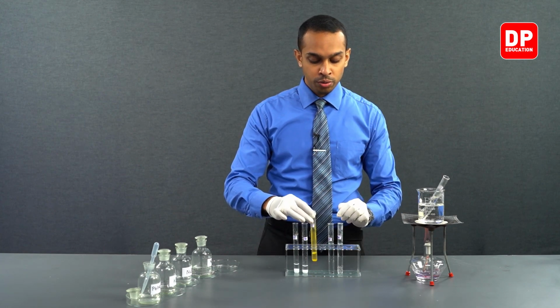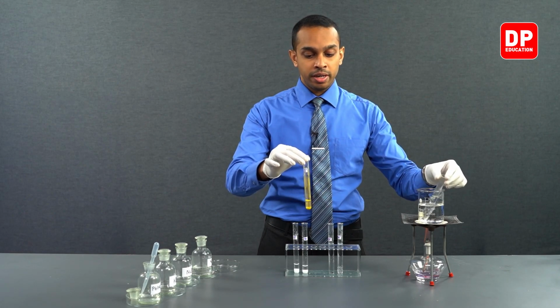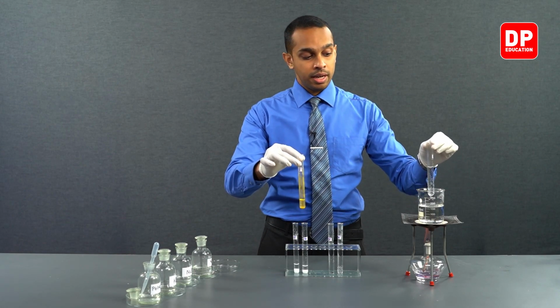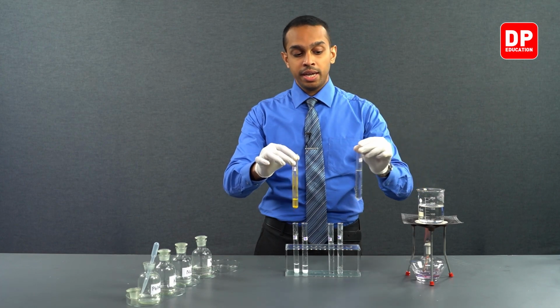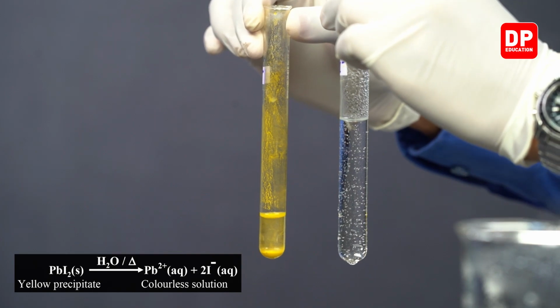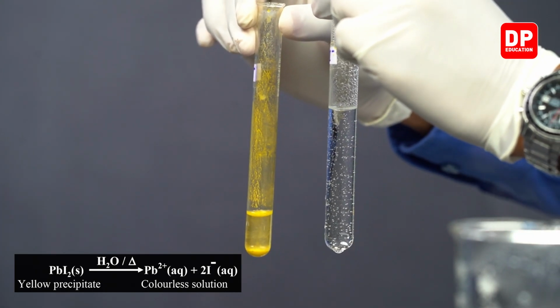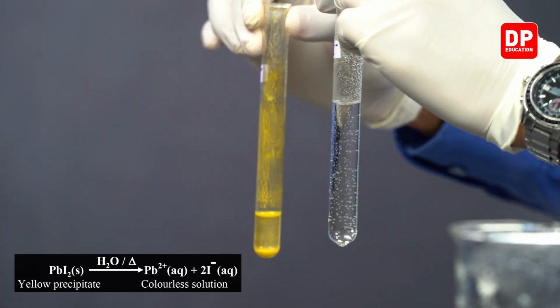And then we'll move on to lead iodide. Again, we took a little bit of lead iodide precipitate and heated it with a little bit of water, and now you can see the lead iodide precipitate completely dissolved in hot water and formed a clear solution.